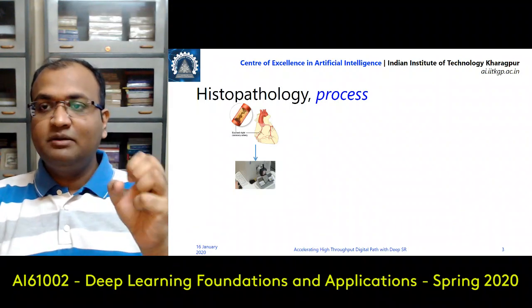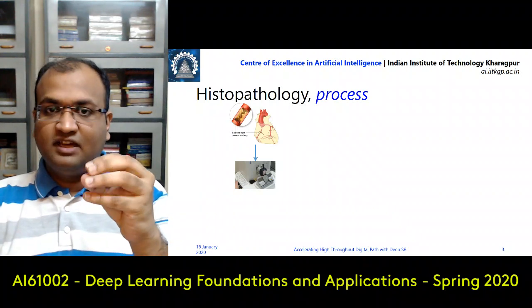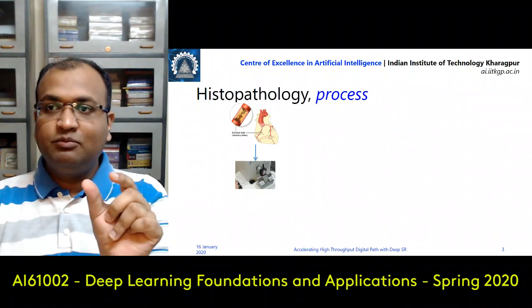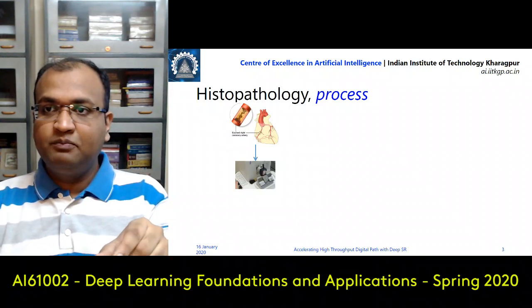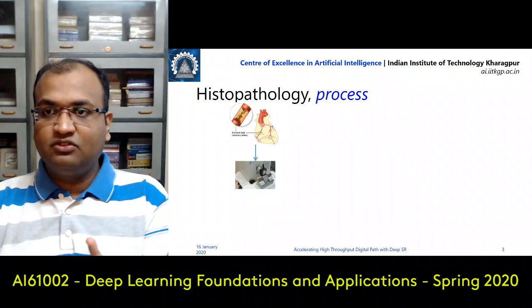But then the moment it becomes hard, and because everything was pulled out over there, it also loses its tensile strength. So now it will become very crumbly and it breaks apart. So what you do at that point of time, while you are doing all of this process, is take this one very delicately and put it inside wax, standard beeswax or paraffin wax or whatsoever.